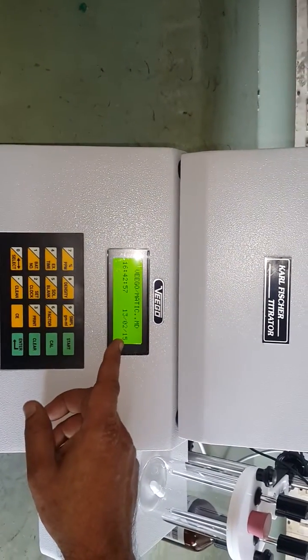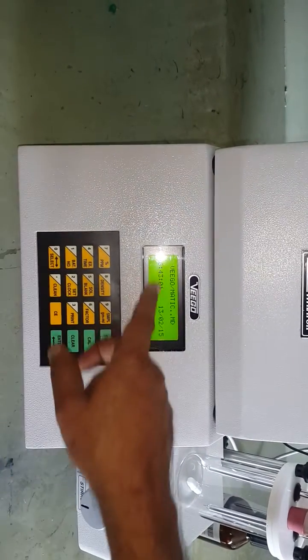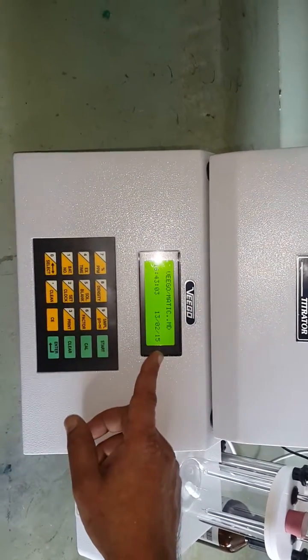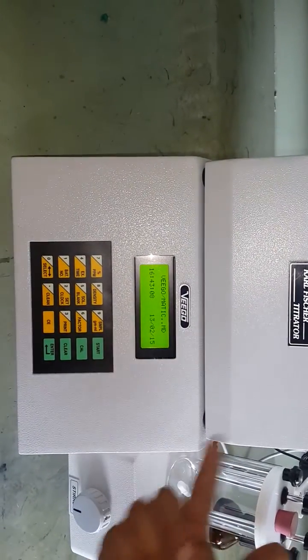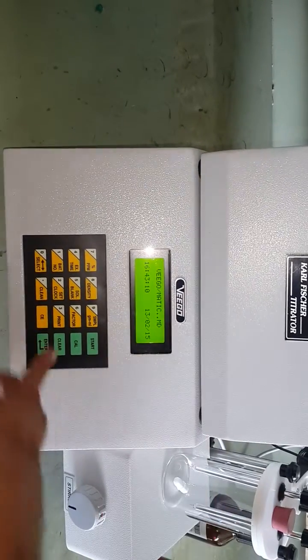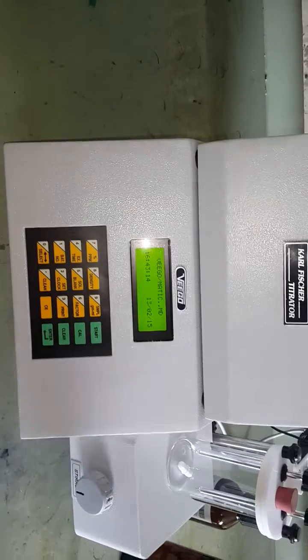The instrument will show you the time and date. You can set the time using the set clock key, but it is optional — the time is already set. There is an internal battery so it will keep the time in memory; you don't have to set the time and date every now and then.